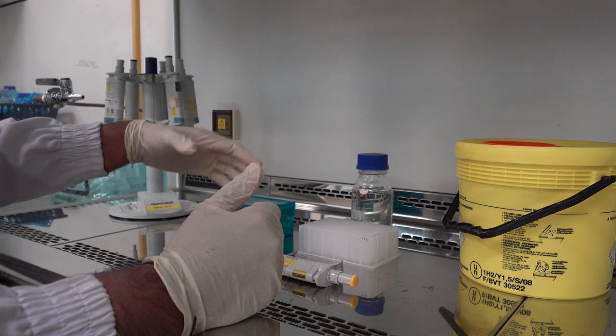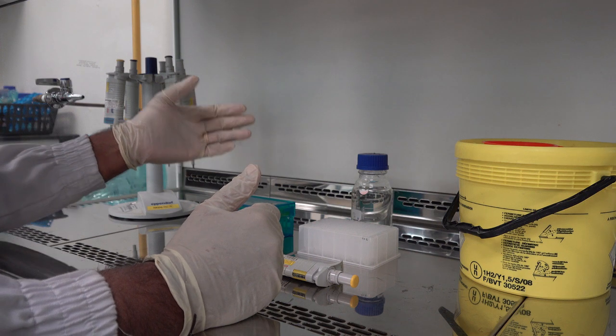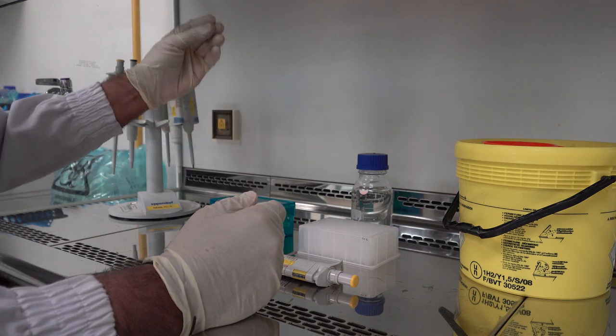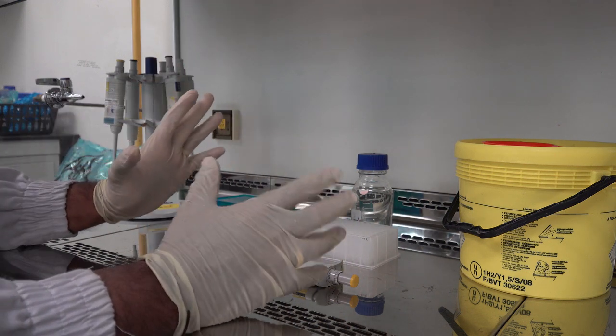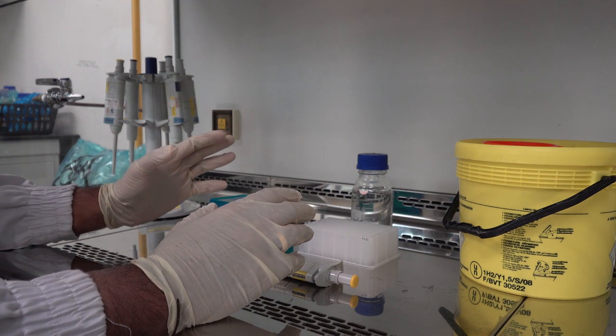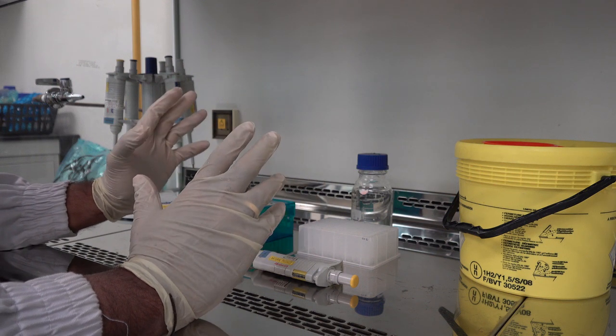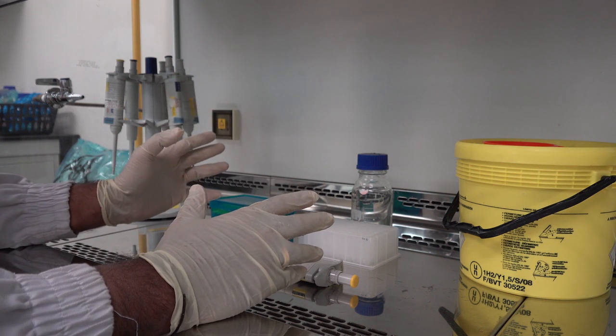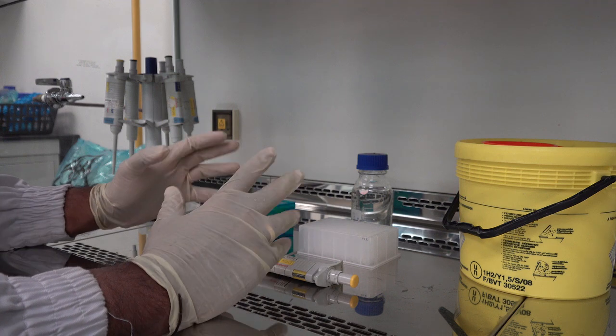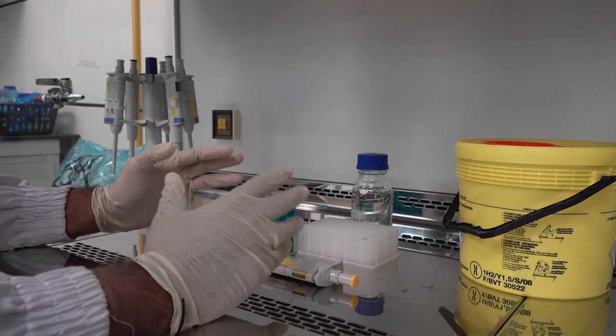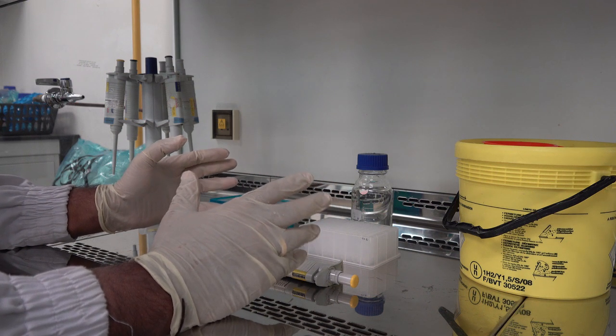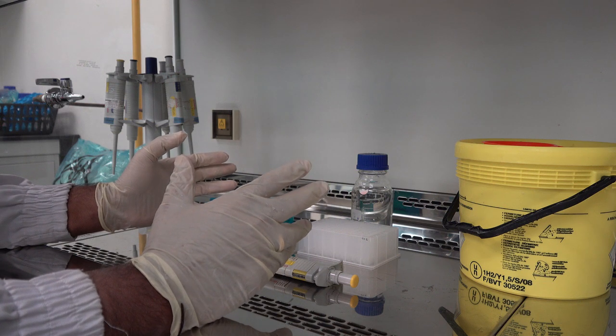There are some things which you cannot do in a biological safety cabinet. For example, the usage of open flames is not permitted as the flame will generate a convection current which can disturb the flow of air in this biological safety cabinet. The second thing which you cannot do is operate centrifuges in this environment, as centrifuges have their own specific air flow patterns generated by their cooling motors and this can in turn disturb the air flow. These are some of the precautions which you need to take into consideration when working in a biological safety cabinet.